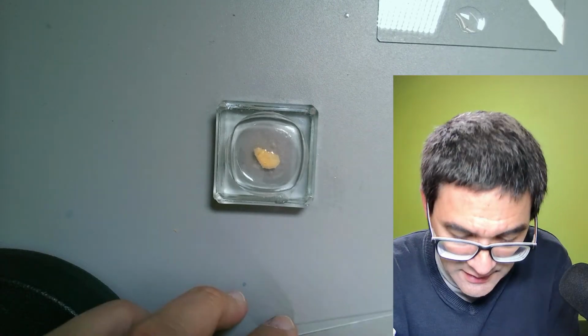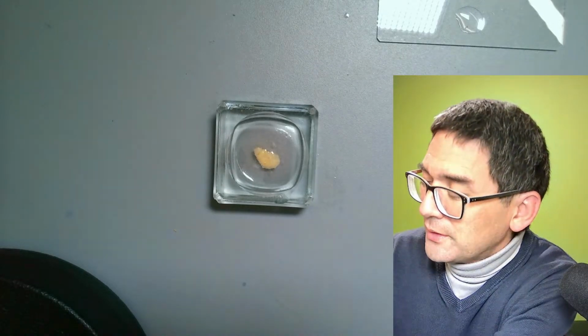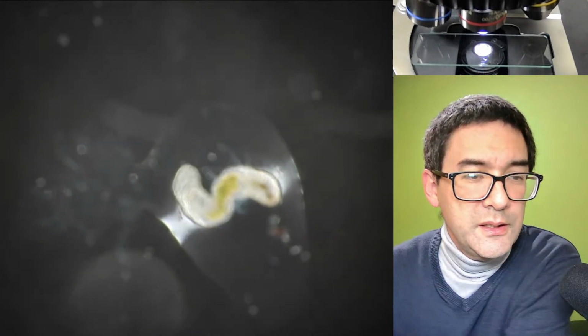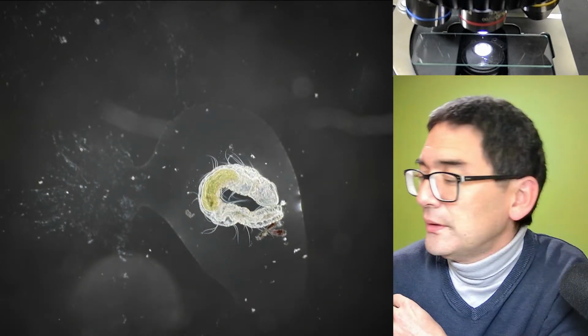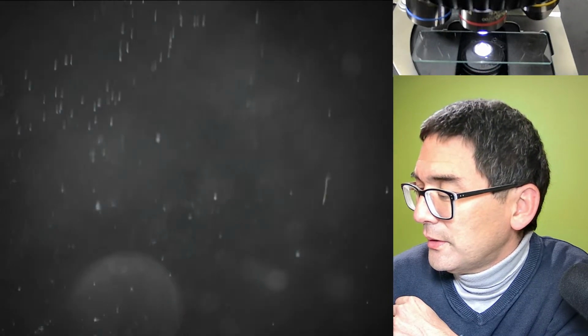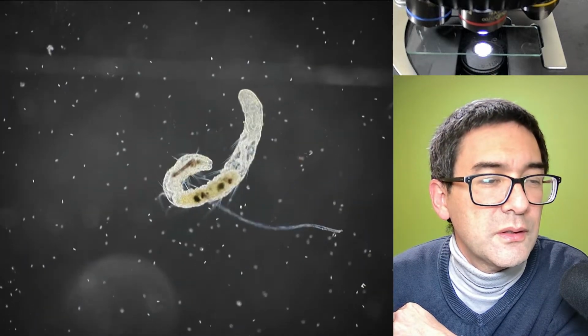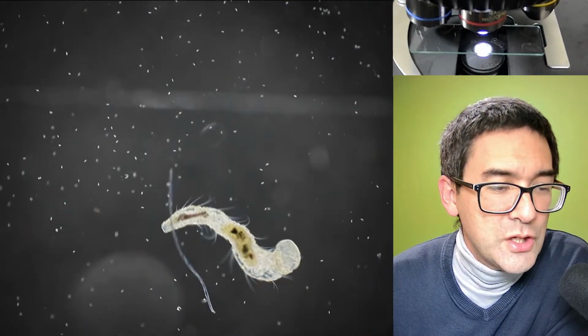So Aeolosoma is a so-called segmented worm, quite different from the flatworm that I showed you before. And the scope view. Oh yeah, again, dark field, here it is. Let me refocus. That's actually a small one. The other day I found one with quite many diatoms in the digestive system. Where's the second one? Here it is. Here you can also see the food that's in the digestive system.